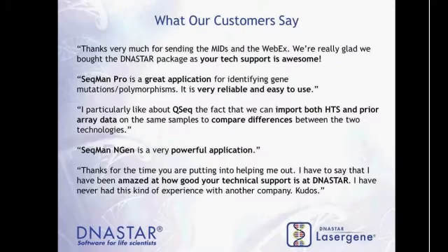One last slide here. These are just some customer comments that we have. And you can see some of the nice comments, powerful software. But really one of the most consistent pieces of feedback that we get is customers really appreciate assistance that they get. They purchase the software. They've got a deadline to make for a poster paper presentation, and they need to analyze data. And the tech support people here can really help out researchers that are using the software and train them on how to use the software, and then also troubleshoot when a problem does arise.